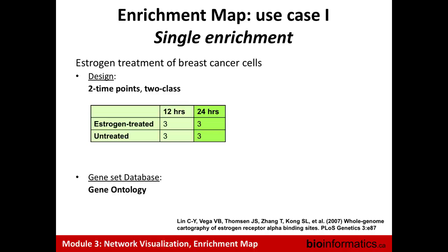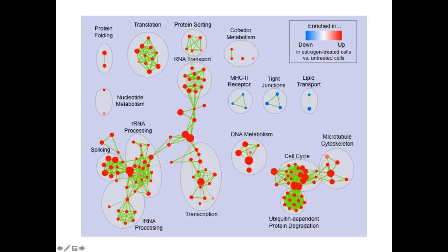Here's an example with data published in 2007 — breast cancer cells were treated with estrogen or not, looking at how this response changed over time. Focusing on 24 hours post-treatment, they did three biological replicates of treated versus untreated, did all standard processing, got differentially expressed genes, ran it through GSEA, and loaded the results into Enrichment Map. You can see immediately that major themes pop out — translation, protein sorting, RNA transport going up, and others going down. This visualization allows you to quickly see what major themes are going up and down at a glance.